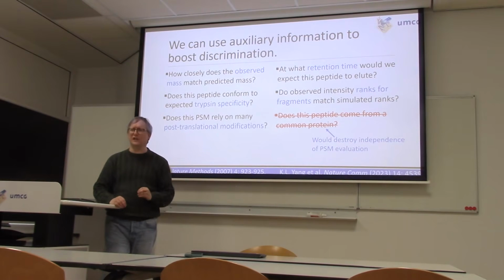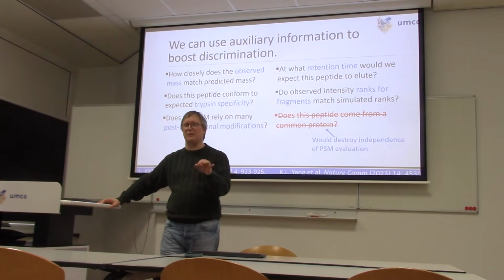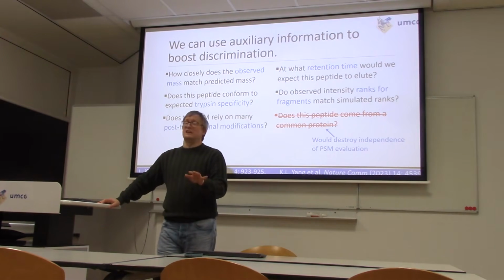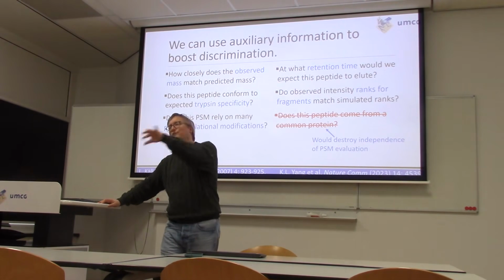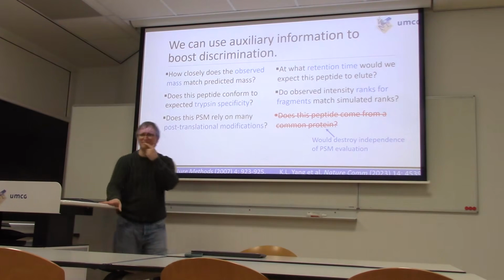If you do a phosphorylation search, and this peptide that your PI is so excited about bears 4 phosphorylations on it, it's not trustworthy, not really. Sometimes those are real, but frankly, it's quite often the case that the software uses post-translational modifications to force a fit between a sequence and an MSMS. And those aren't so trustworthy.